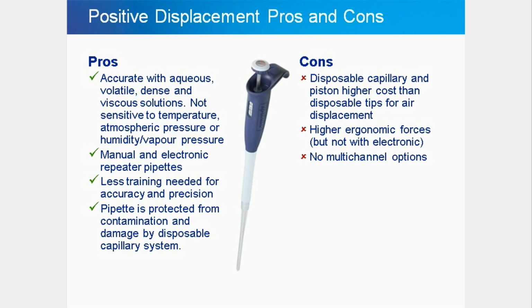Negative aspects are: the disposable capillary and piston have a higher cost than disposable tips for air displacement. Higher ergonomic forces are required for pipetting. There is no multi-channel option.